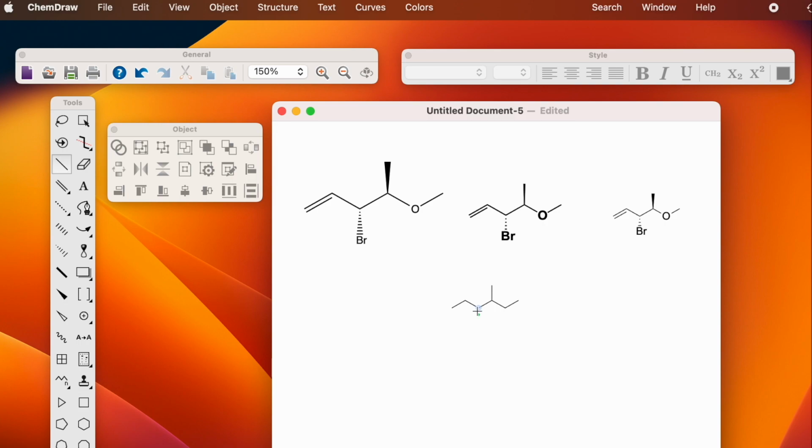If you don't want that, you could either click and drag. If you want to make 2 methyl groups there, so you want to have them evenly spaced, you can do that. You can also select, instead of the whole drawing, so up here these top 2 are lassos, instead of selecting the whole drawing, I'll click somewhere else so nothing's selected. You can just select one atom and then you can move it and make it a different angle.